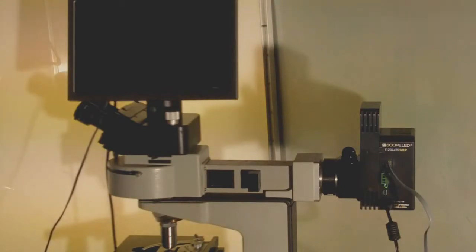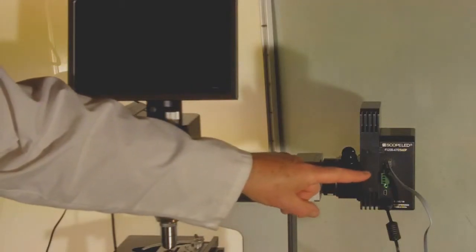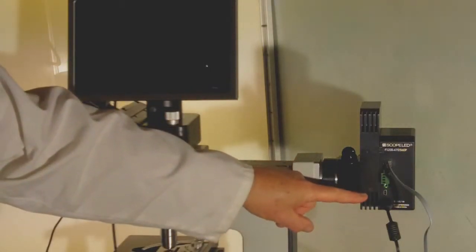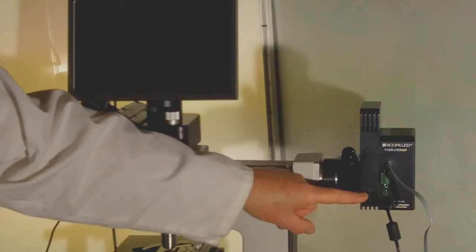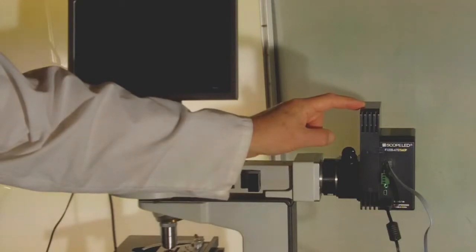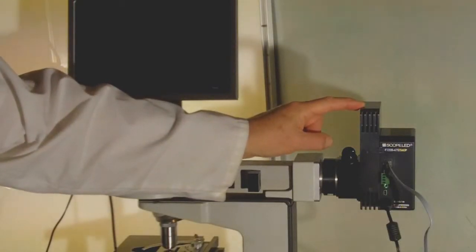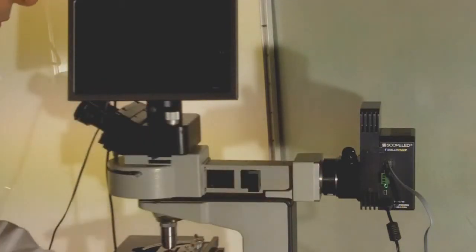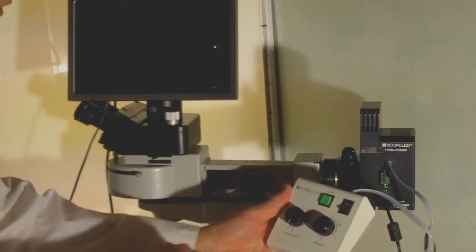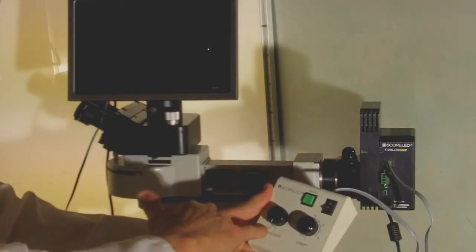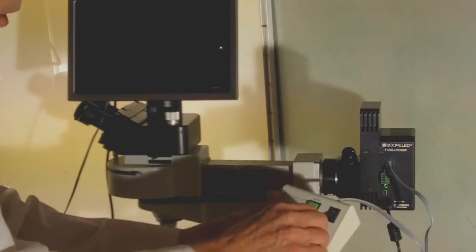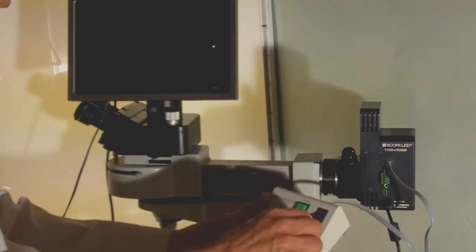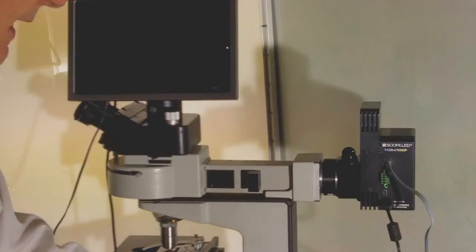This is the Scopeled F-Series, which has two wavelength fluorescence. We have a fluorescent blue light exciter built into the illuminator itself, and a secondary LED for green light excitation mounted above. With this control unit, we can quickly switch from one lambda to two lambda and adjust the intensity of the LEDs as needed.